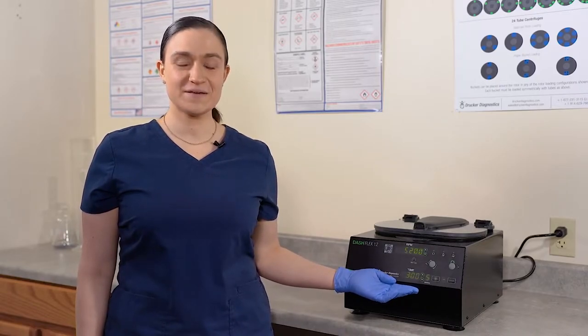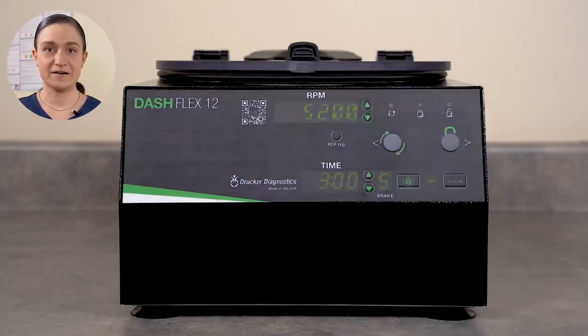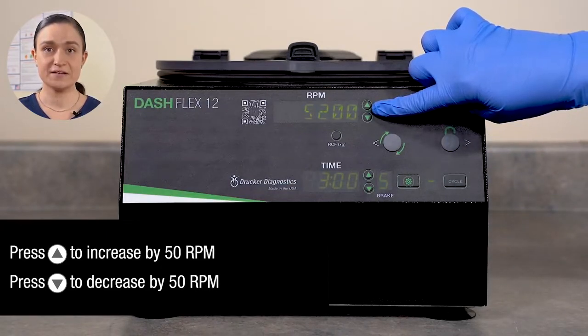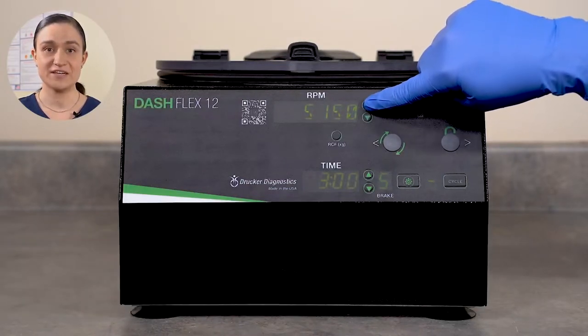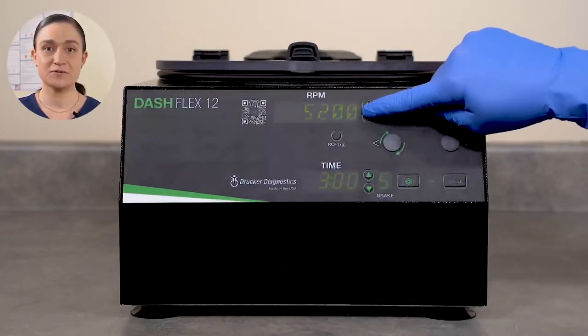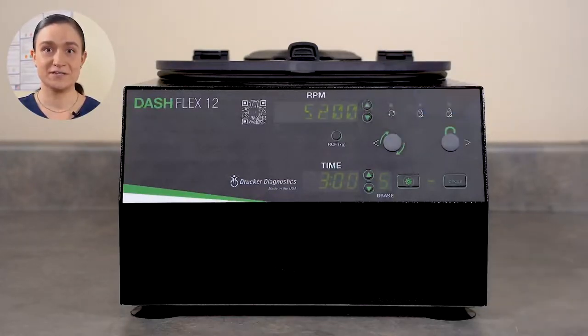Now that we have our Dash Flex 12 set up, we can take a look at our controls — Part 2: Controls Overview. Your Dash Flex 12 has all of its controls right here on the front panel. The RPM screen displays the currently selected speed in RPMs. The RPMs can be adjusted using the buttons next to this screen. A single press up increases by 50 and a press down decreases by 50. As we adjust, the RPM shown on the screen will adjust as well. If you overshoot or undershoot your desired RPM, you can use the buttons to adjust back to your desired mark.